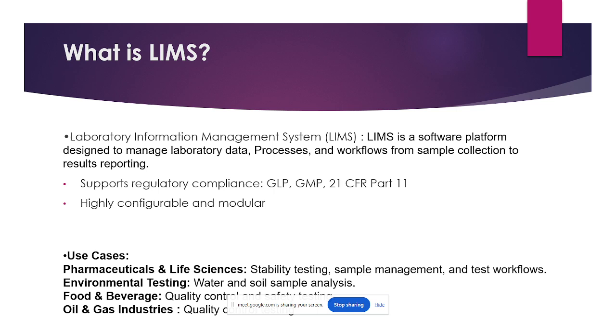In this software, two types are there: web based, and also SaaS based, like cloud based. Web based and cloud based I will explain later in the further class slides. It is a software platform designed for managing data, and there will be workflow modules. Based upon those, the process will go on in the LIMS. Finally, there is result reporting, and after result reporting we can generate the COA, a certificate of analysis, or report files.